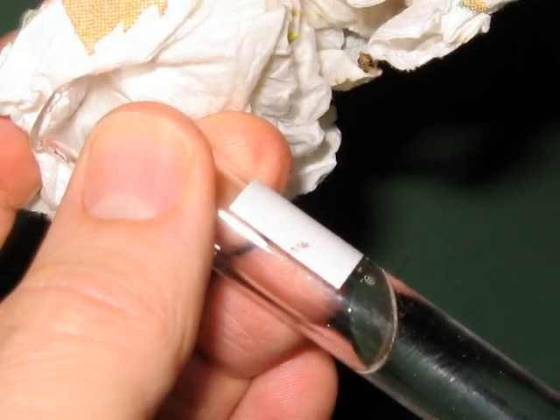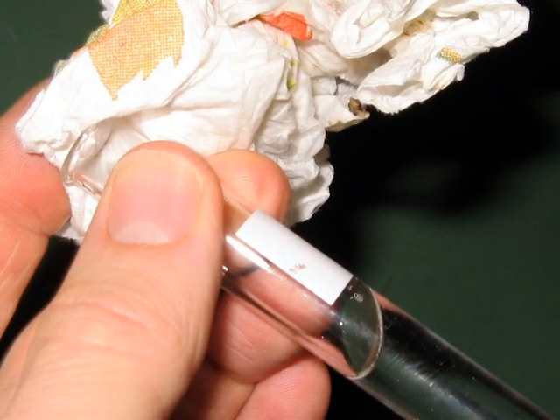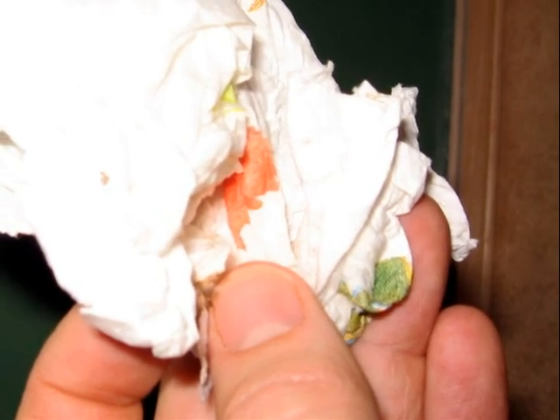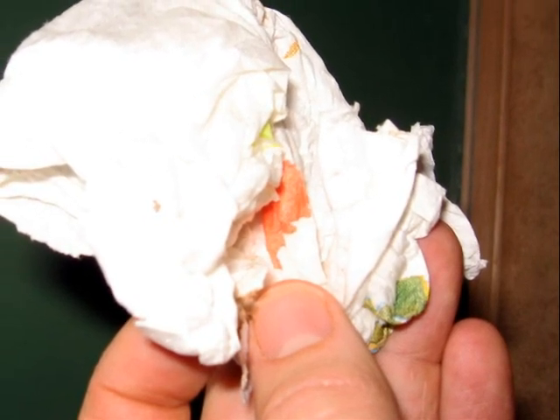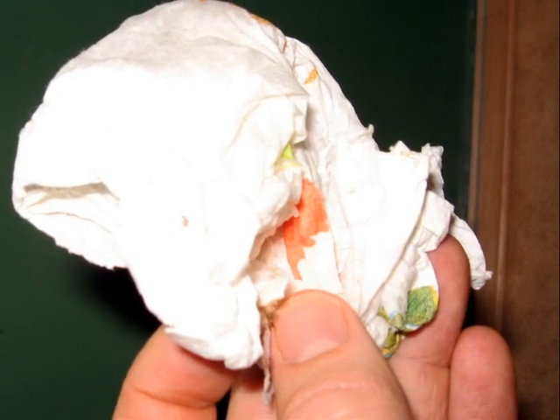Take a small amount of your essential oil and pour it onto an unscented tissue or paper towel. Wave the paper towel in the air to allow the alcohol to evaporate off. What is left on the paper towel is the essential oil that you've extracted. If you have a strong smell from that essential oil, you did a great job.